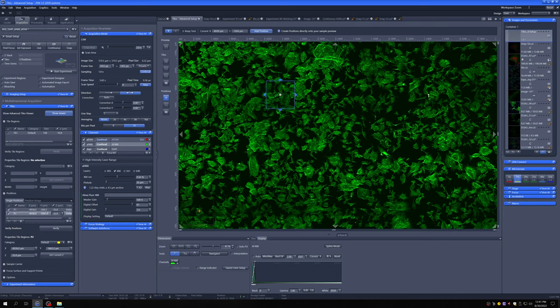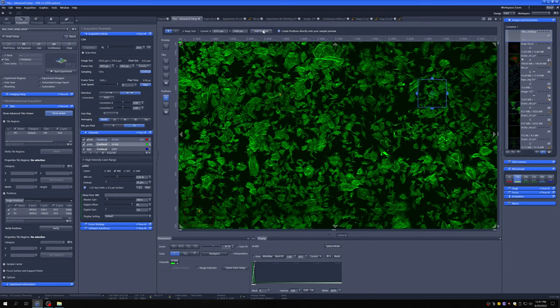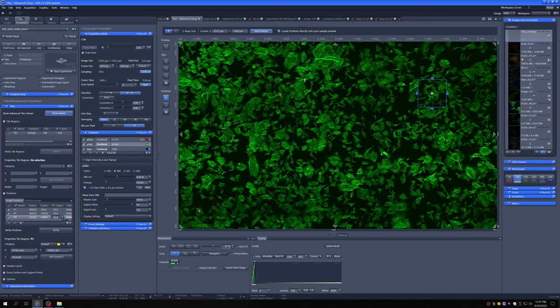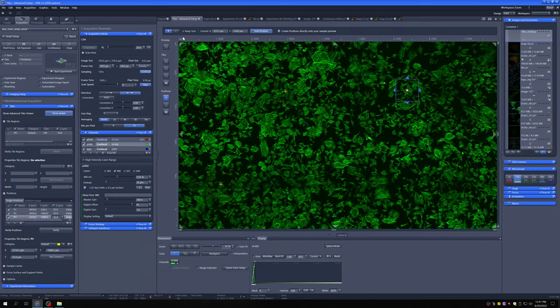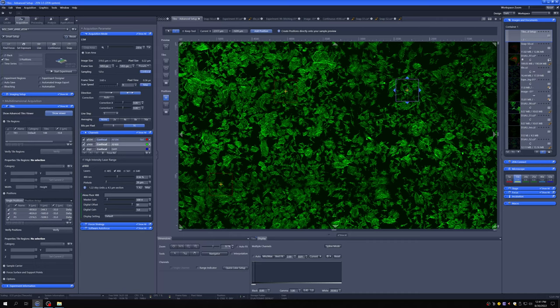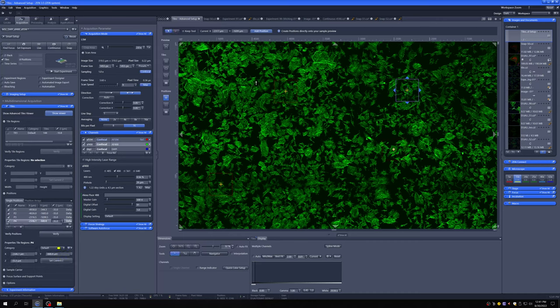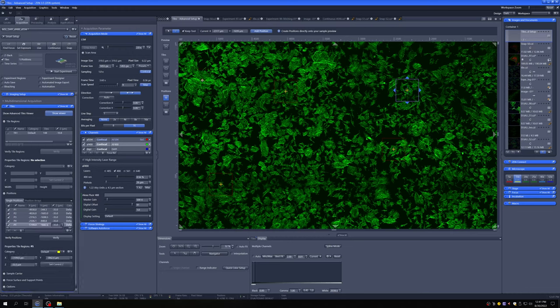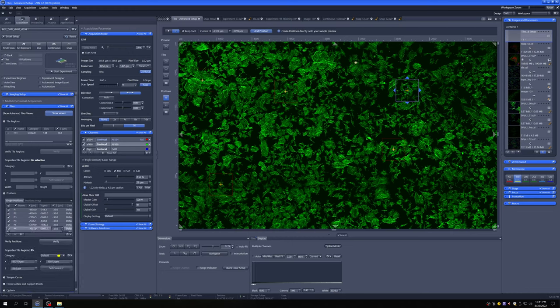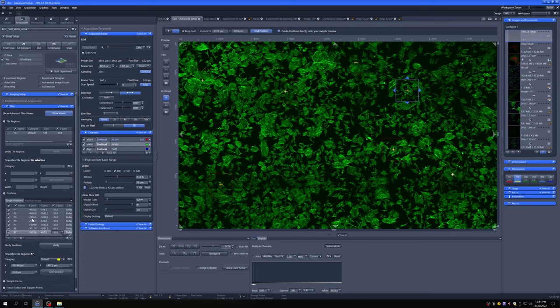We can also add them automatically by clicking on this. And if we want to keep that going, we can just say keep tool. And then every time we click on this, we'll add a position that will populate a list of positions that then we can navigate.